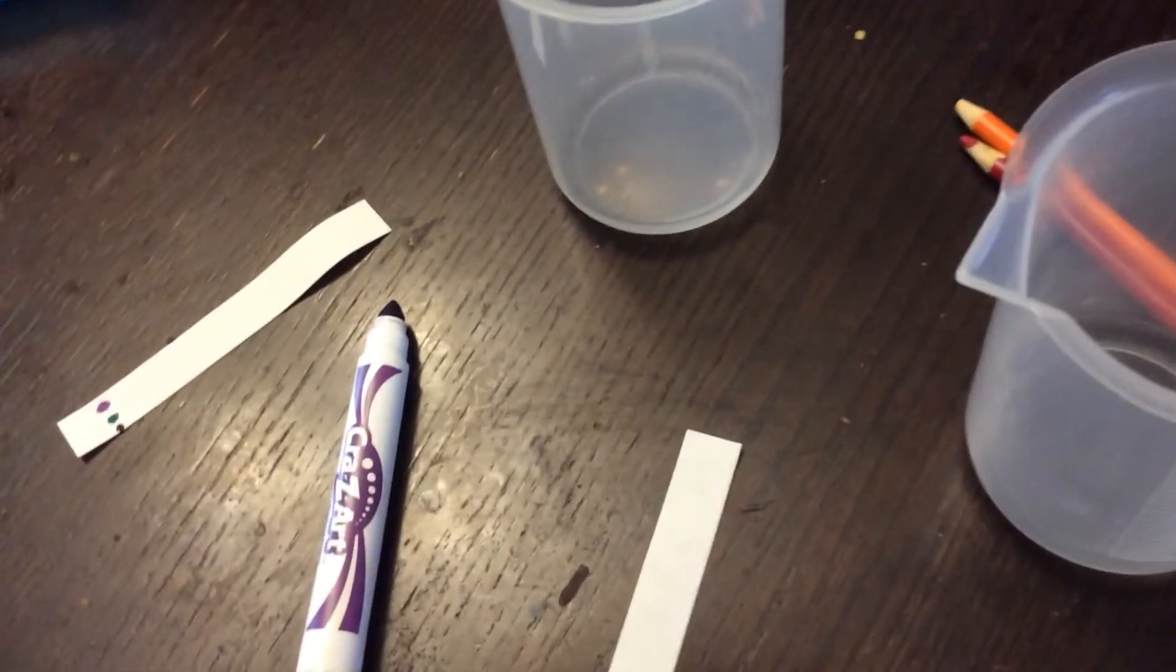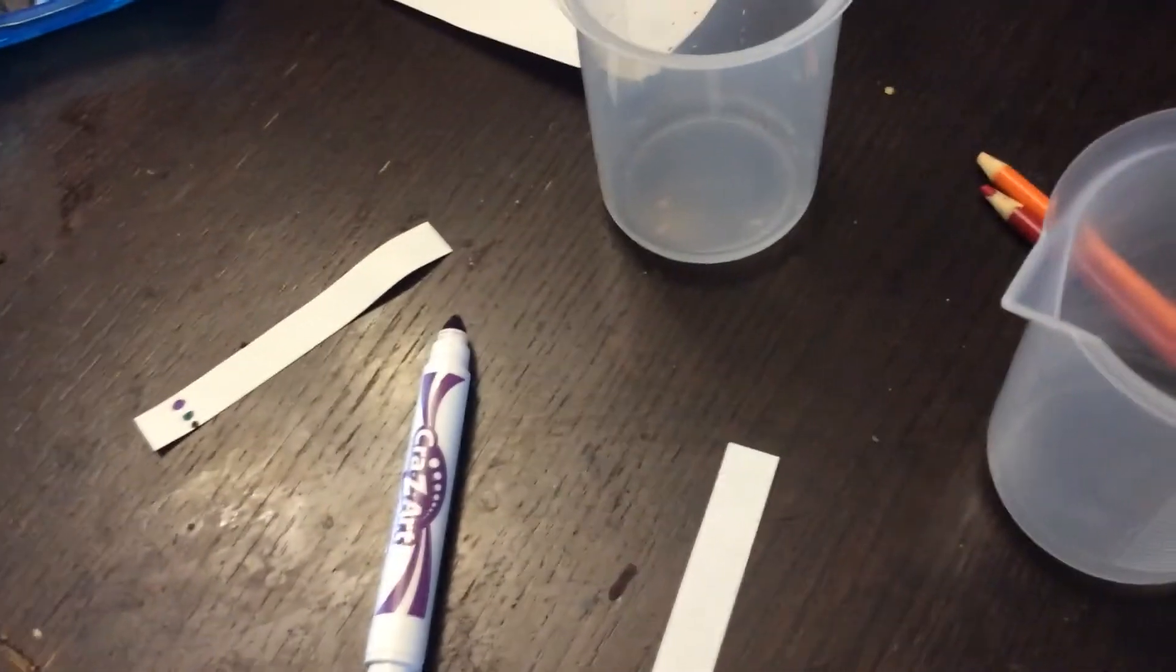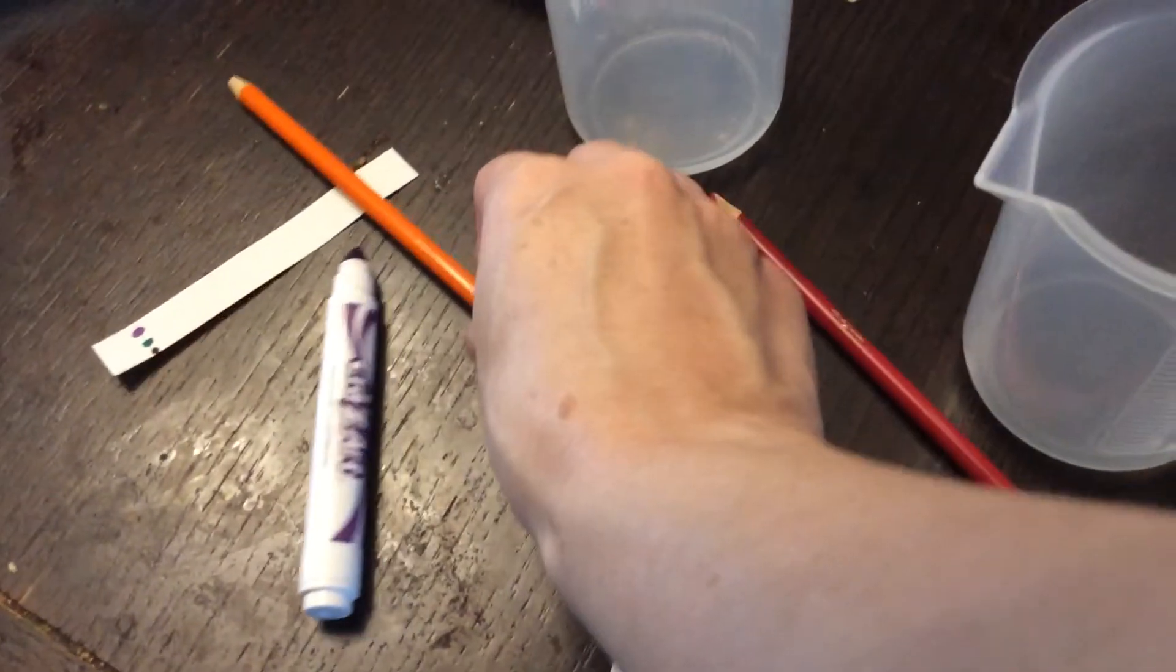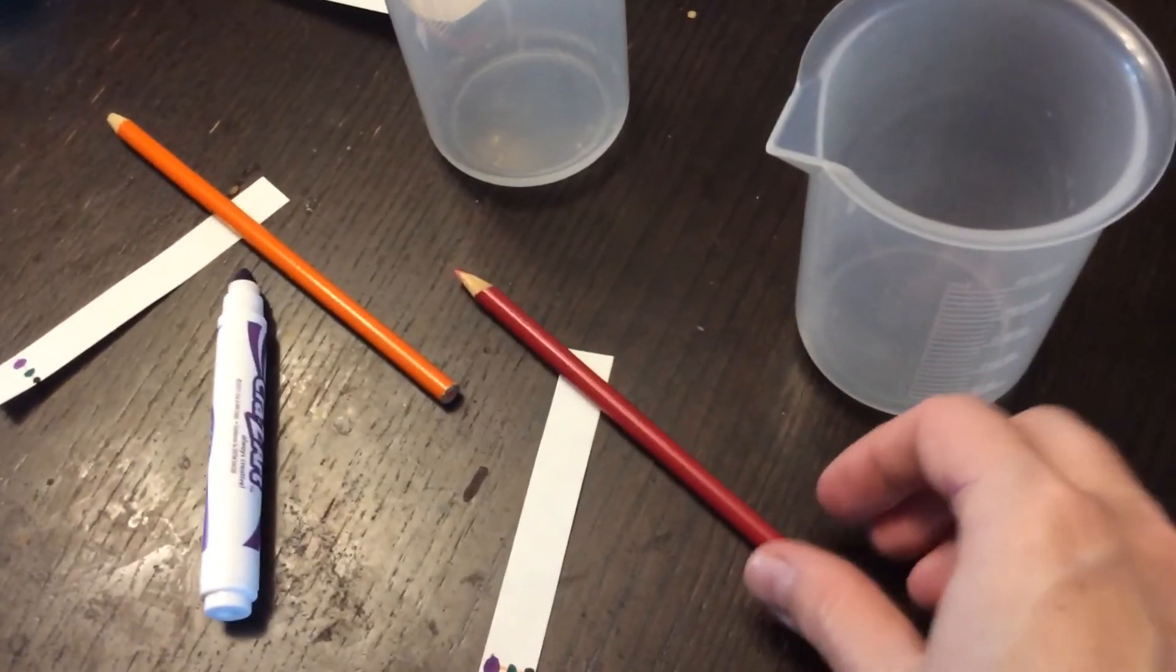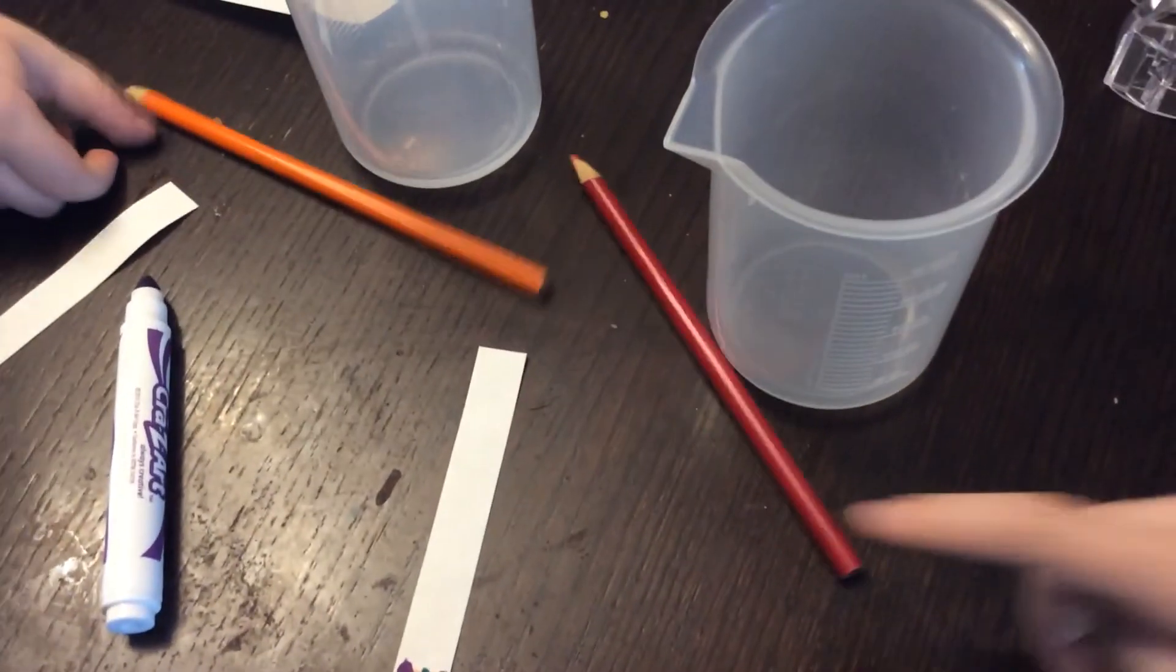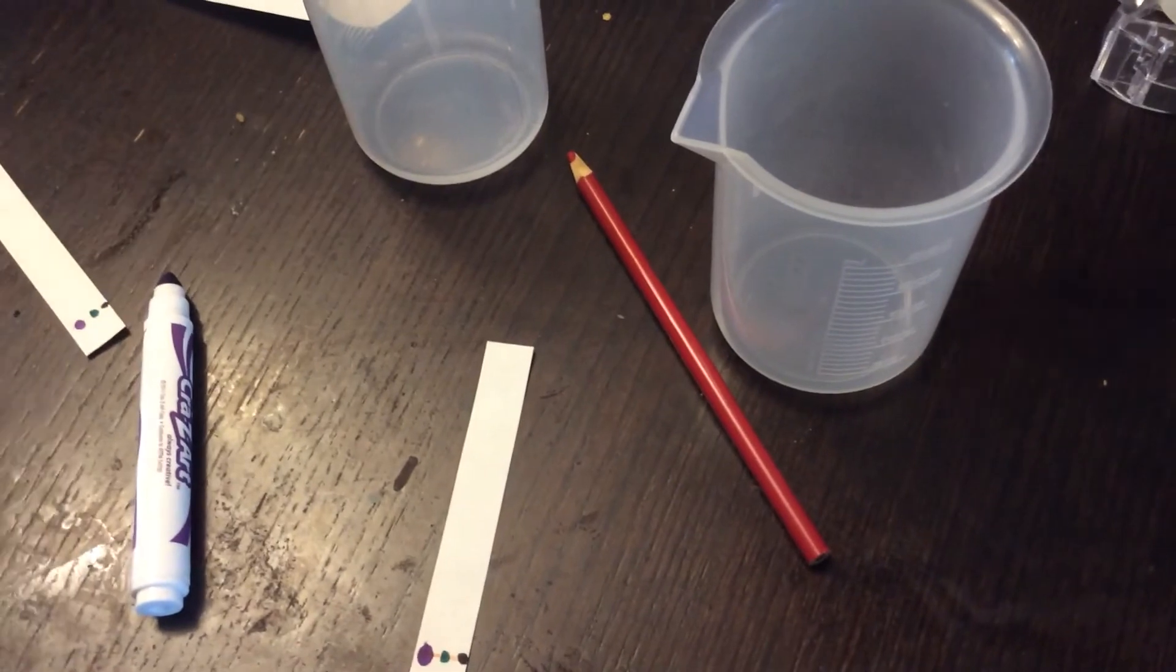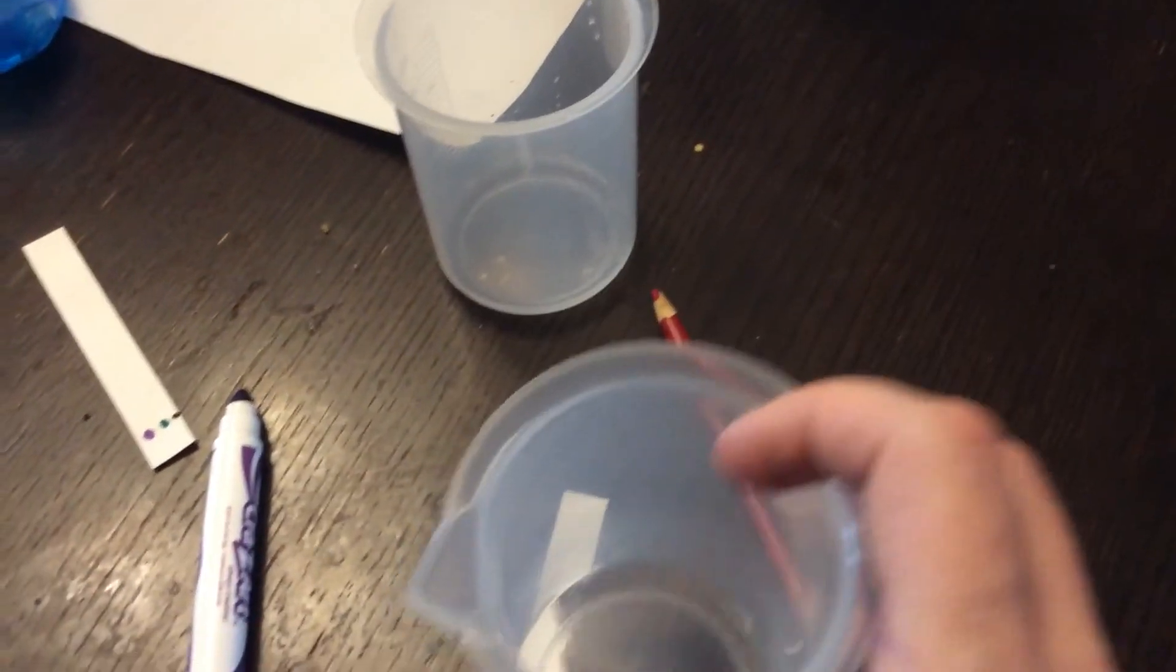More water. Okay, you can pour this water in a minute. Alright, now what we're going to do is we're going to tape these to a pencil and we're going to set it inside our chromatography column. And then we'll let you see what the finished result looks like.